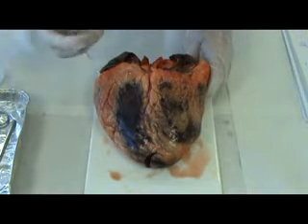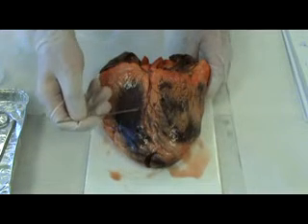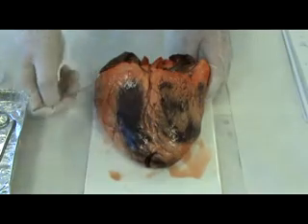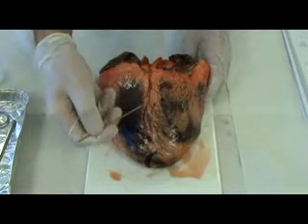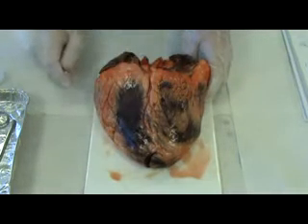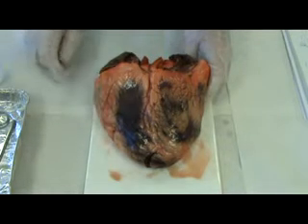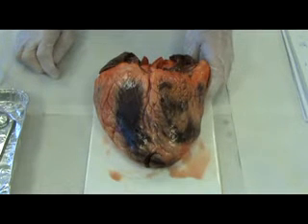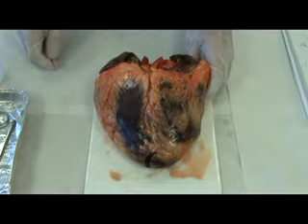Also notice that the visceral fat follows the branches of the coronary arteries. In a way, the fat helps to protect them, because they're quite close to the surface of the heart. The fat also acts as a reserve of energy for the heart. The heart itself is beating without tiring, and that's due to a specialized muscle.